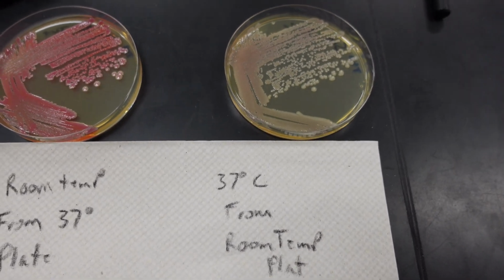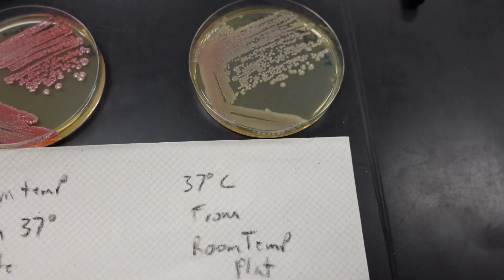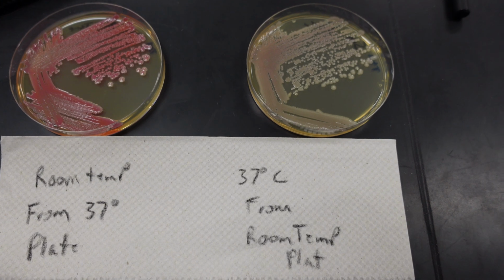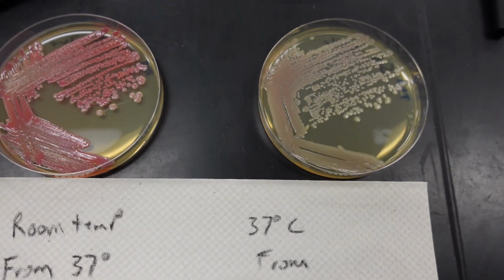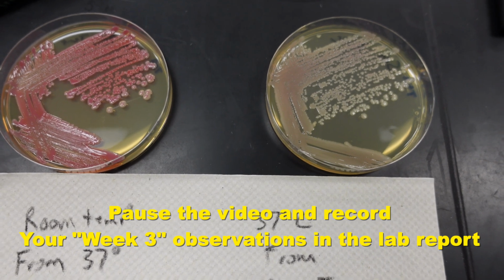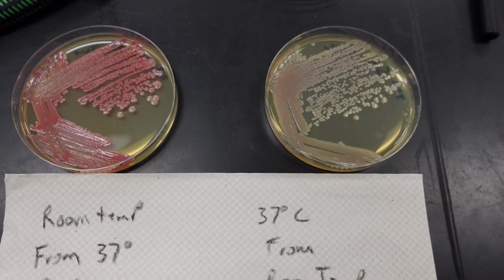So again, the gene is activated at room temperature, and it's kept turned off at 37 degrees Celsius. So record the observations on number 2 in the lab report. And this will conclude the Lab 9.1 lab.